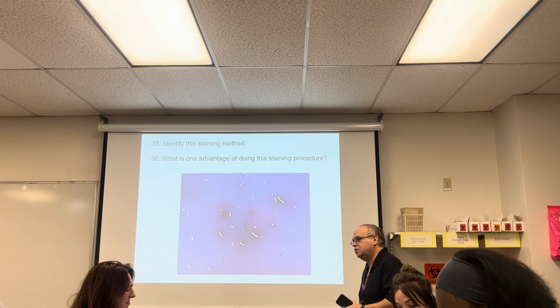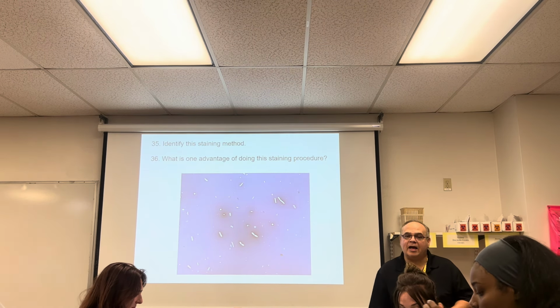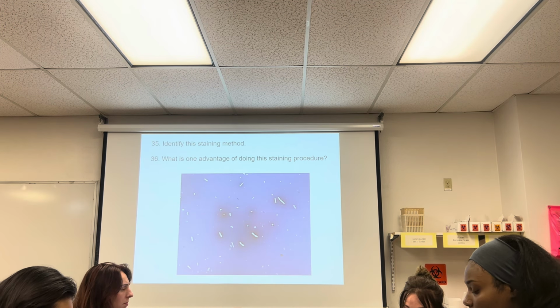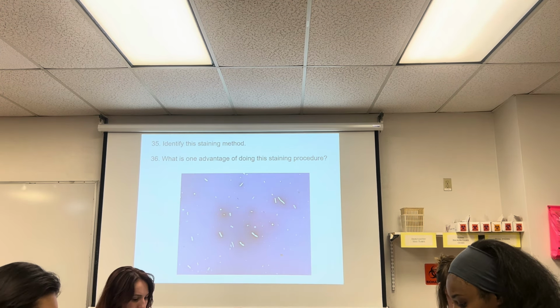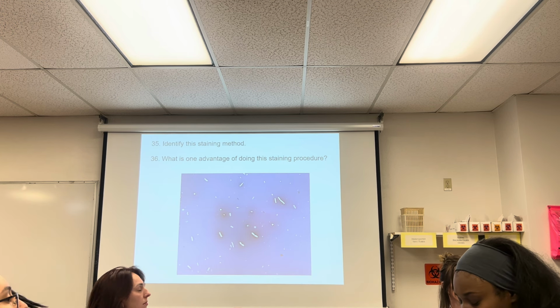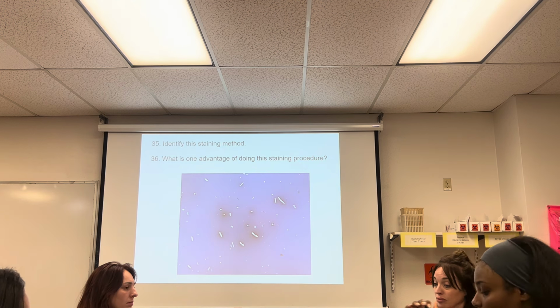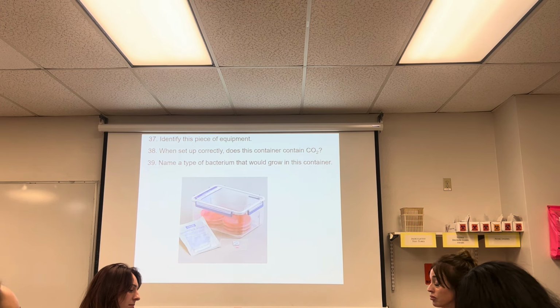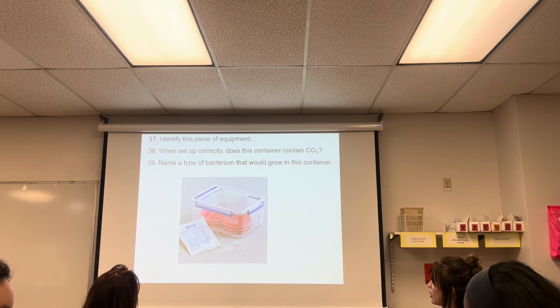This is what happens at the end of the lab. That's why I always tell you put all of your organisms in the baskets and we don't use them, because they get so contaminated after a class. Even though you're getting better and better, you're still sloppy. Okay? Here we go. So what is this thing called?